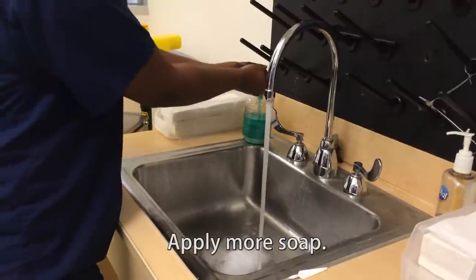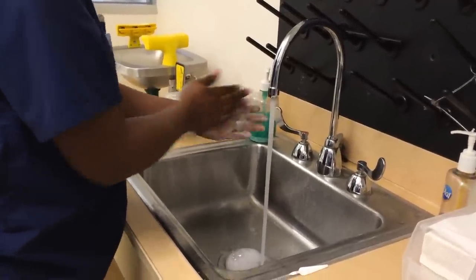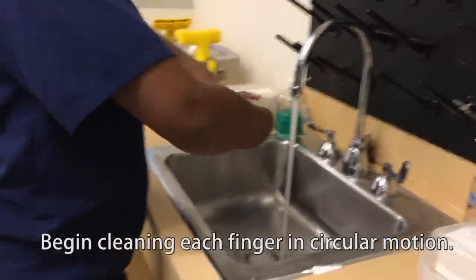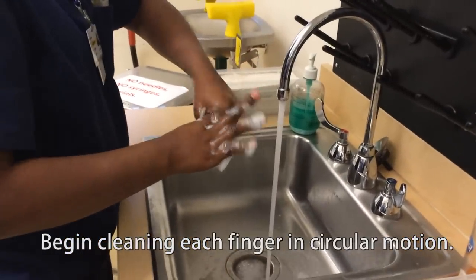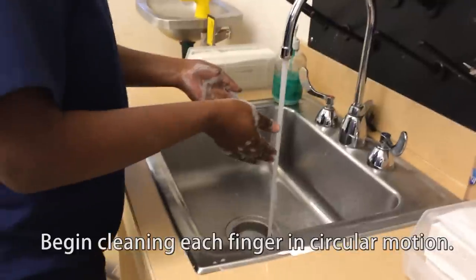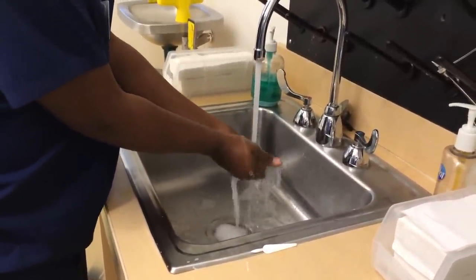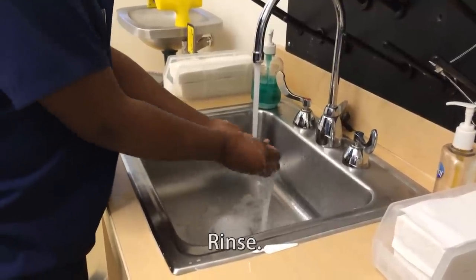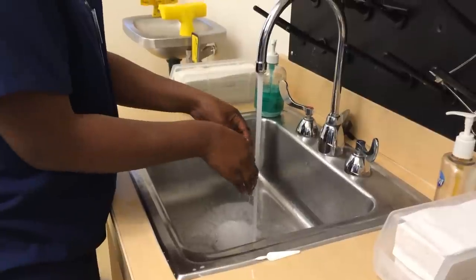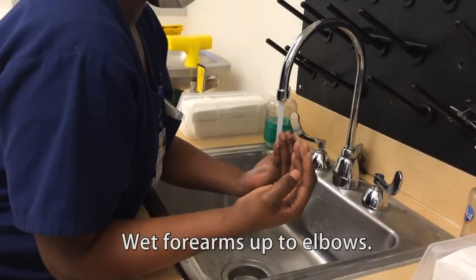Apply more soap. Begin cleaning each finger with the brush in a circular motion. Rinse, then wet forearm up to elbow.